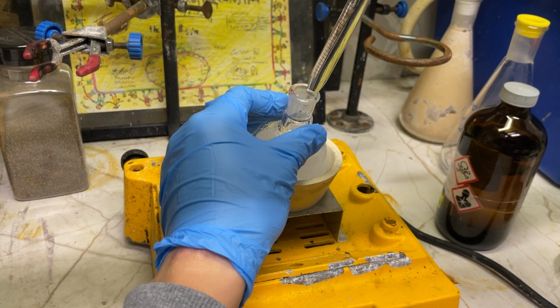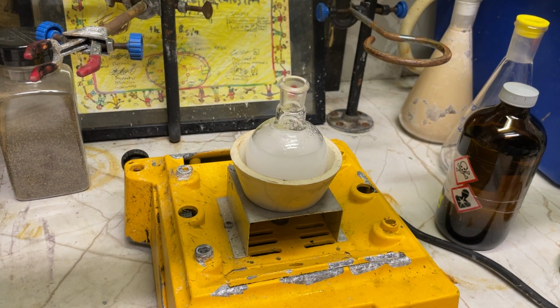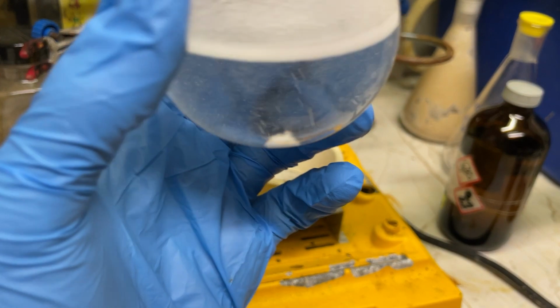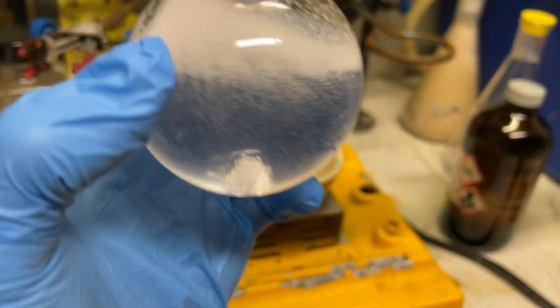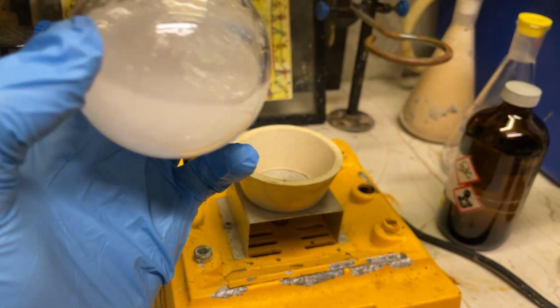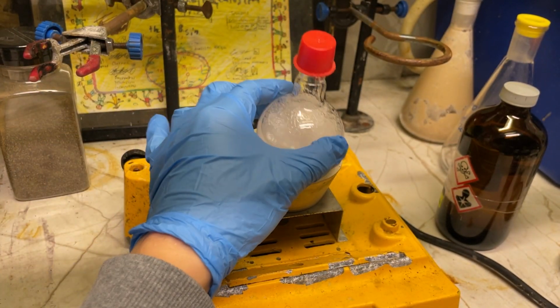This reaction is slightly exothermic, but it's not actually that exothermic, as I found out later. And here you can see hydrogen formation as the reaction happens, of course. So let's take a look at what's actually happening here, because it's sort of an interesting reaction.